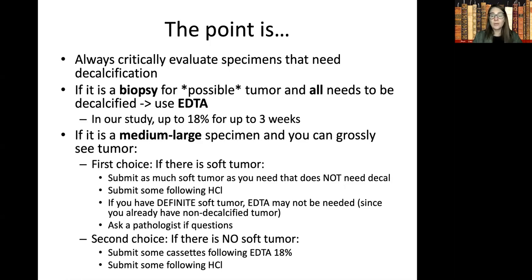We're always happy to work with our prosectors, because sometimes there are questions that we know are coming. At least at the University of Chicago, most of our malignancies end up getting next generation sequencing anyway. So it used to be, oh, this was only by request. Please, please, please make sure the tissue is satisfactory. Today, everything. I would just assume that a specimen is going to be needing molecular testing, at least if you're in a tertiary care institution.